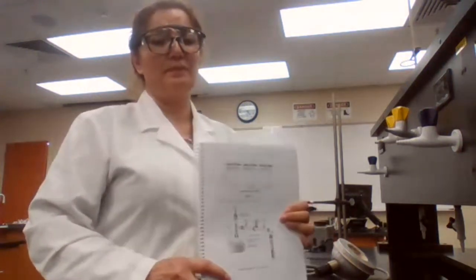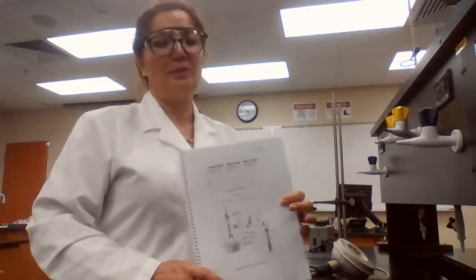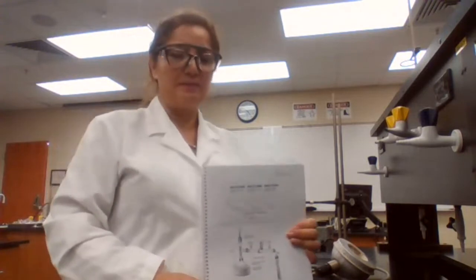The condition for distillation, as I said, is that your impurity must have a much higher boiling point compared to the sample that you are recovering. We have two types of distillation that we are going to discuss in this experiment. One is simple distillation and the other one is fractional distillation. What's the condition for simple distillation?